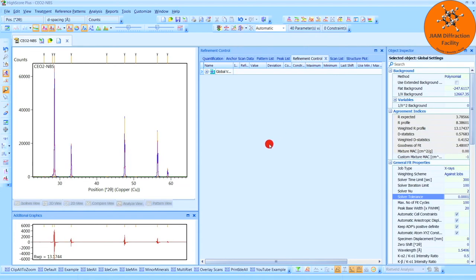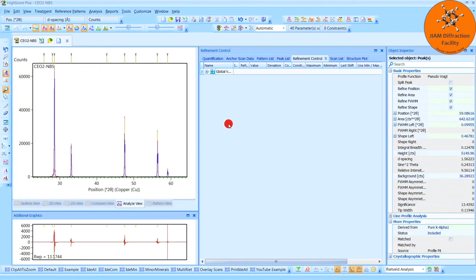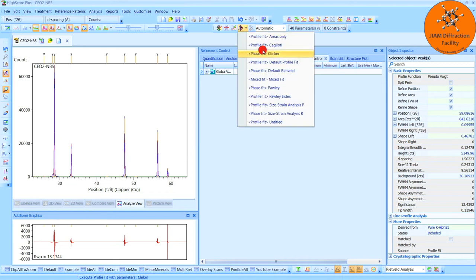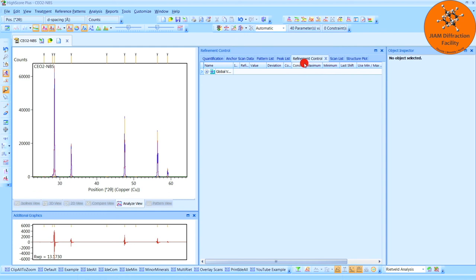And then while in automatic mode, I will click this button and perform a default profile fit. Here we see an RWP value. This gives us an idea as to how nicely the blue and red curves match, so for these types of values, smaller is better. Let me come up here and perform one more profile fit in order to make sure that our RWP is stable. It barely changed, so I'm happy with that.